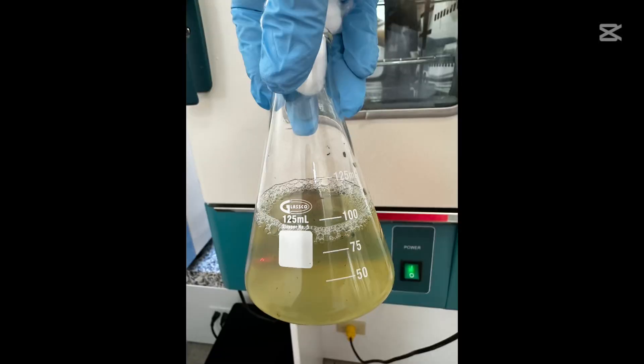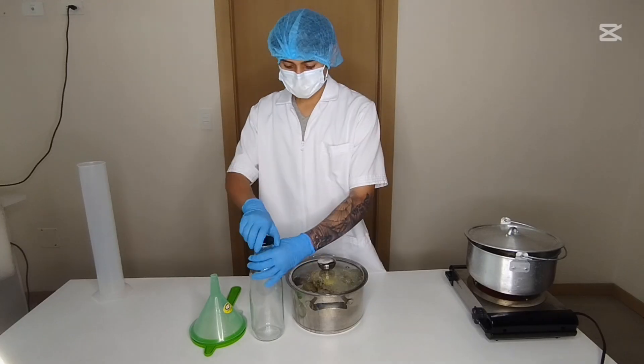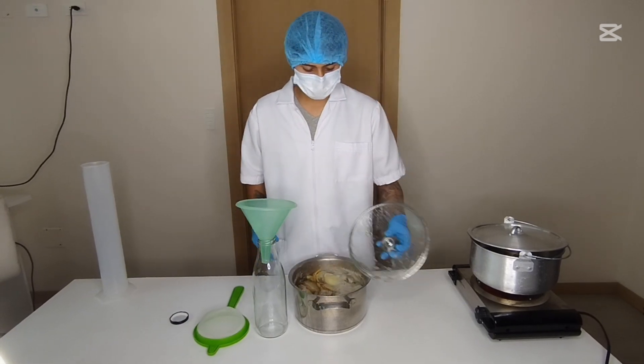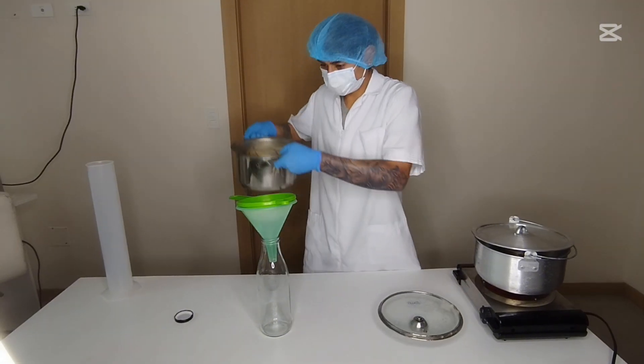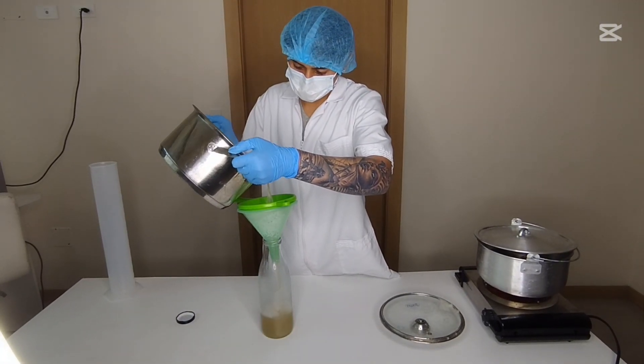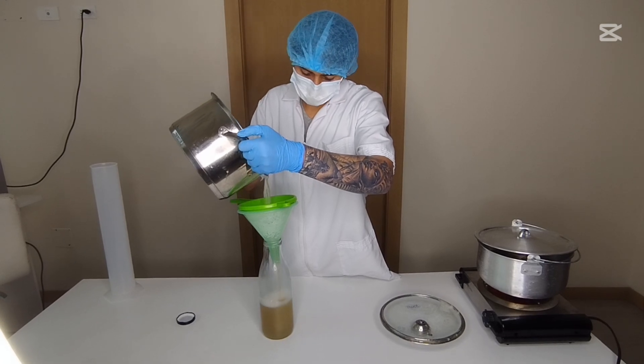Inoculum, or starter culture: yeast, beneficial bacteria, fungi, etc. For the growth medium, use a nutrient solution such as molasses water, yeast extract, or special culture broths. Optional sensors include a thermometer, pH meter, and dissolved oxygen meter.